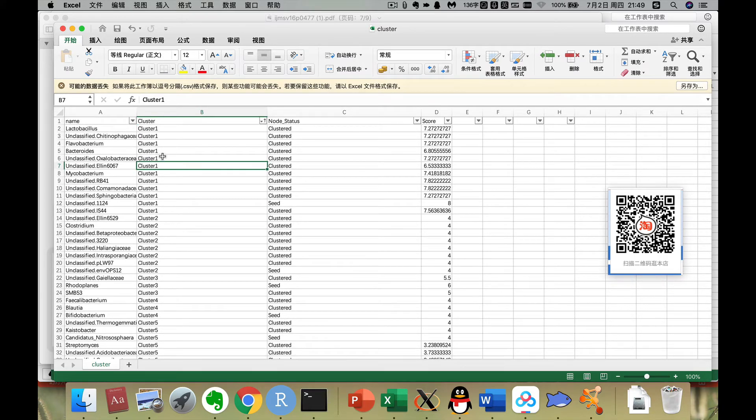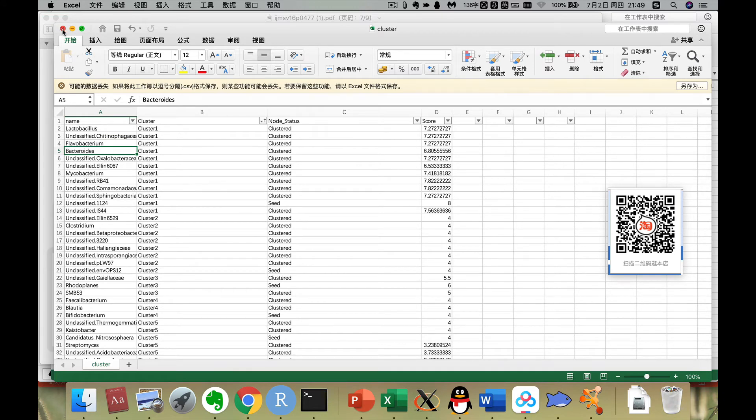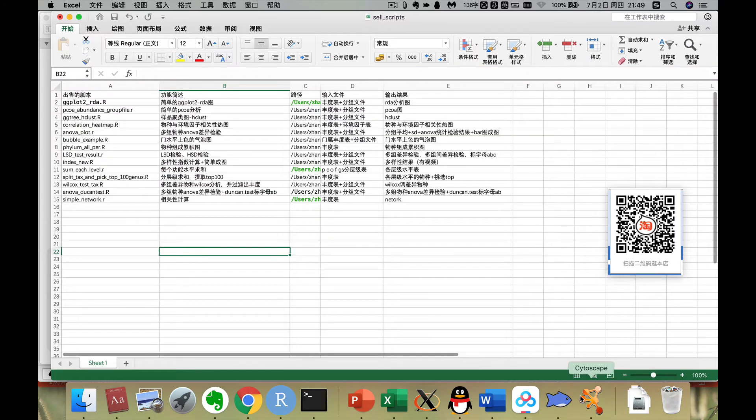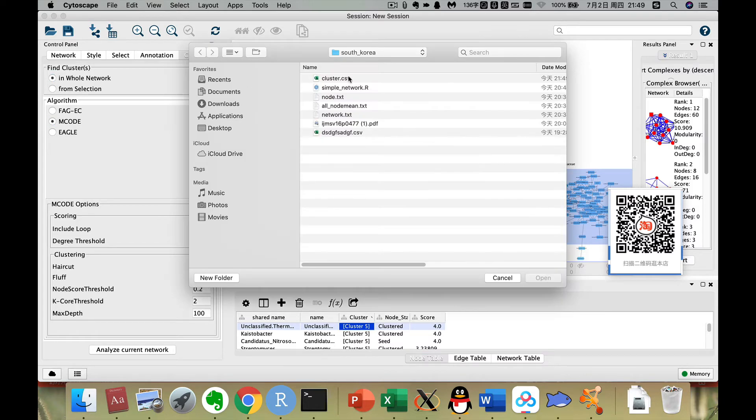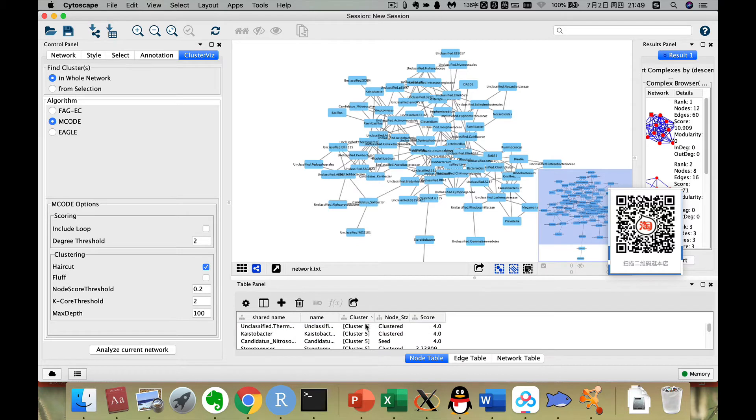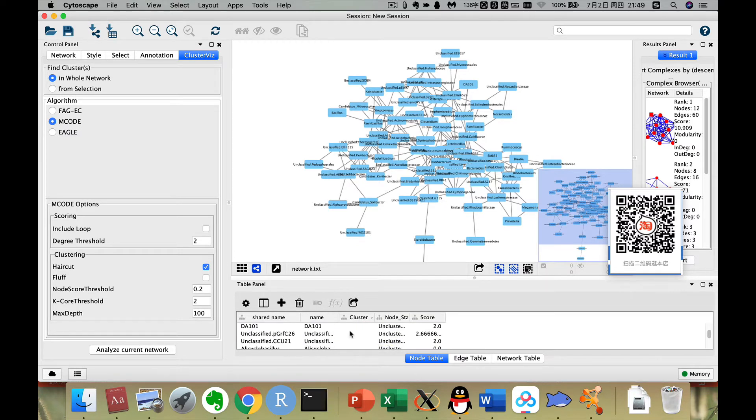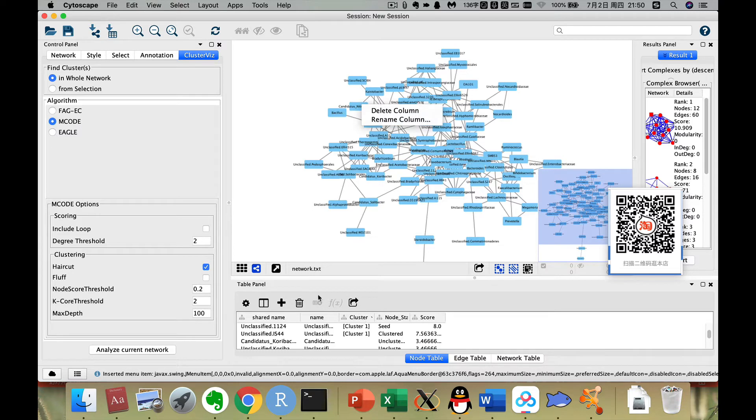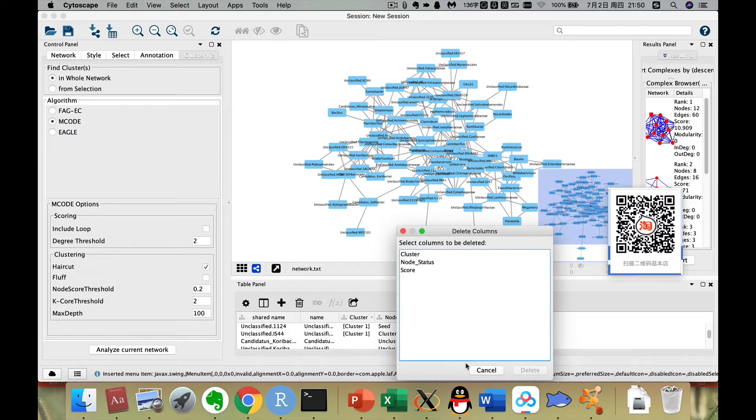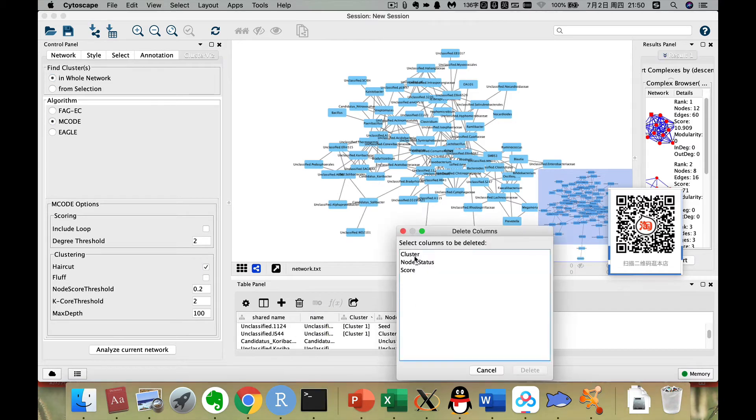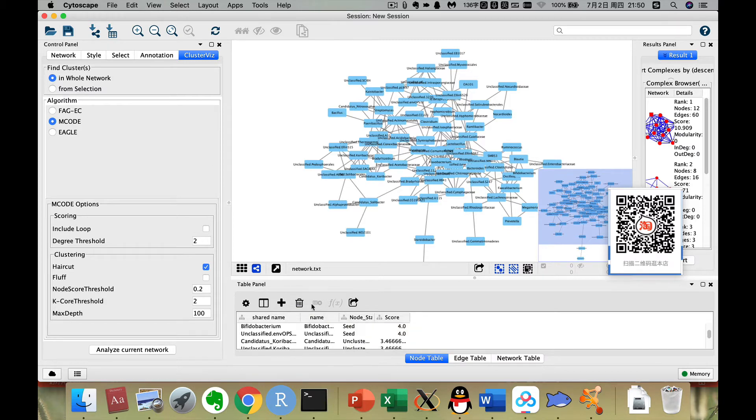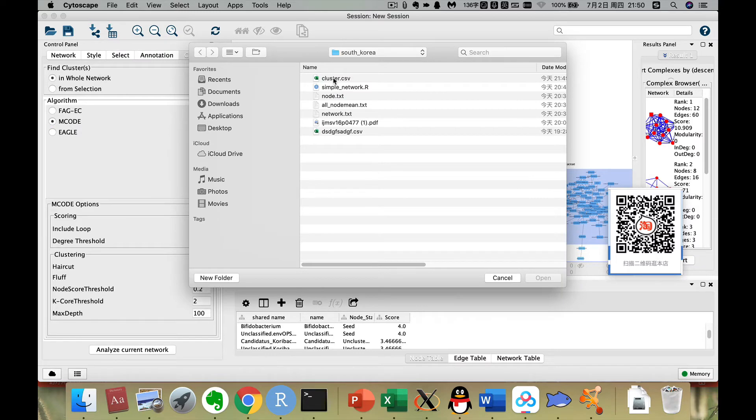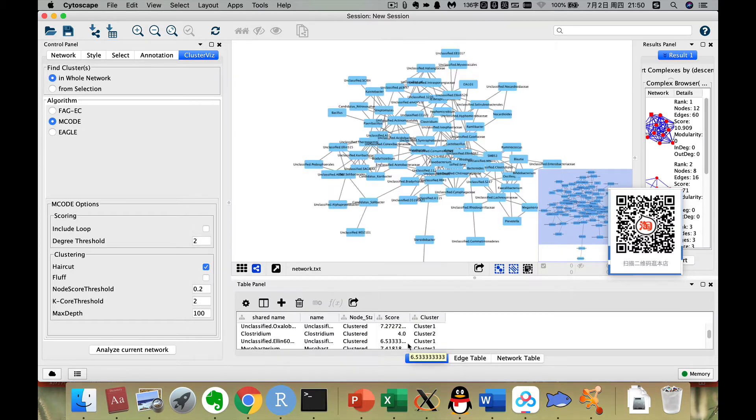Here is our attribute, the node, another node attribute. Now we can go back to this. Now we can just import the node attribute. Then we import the cluster.csv. Now here is also a key. Then we click OK. First we remove this column. We can remove this, delete column cluster. We delete this column first. Now we import again. Maybe it can't replace it. Now let's see.